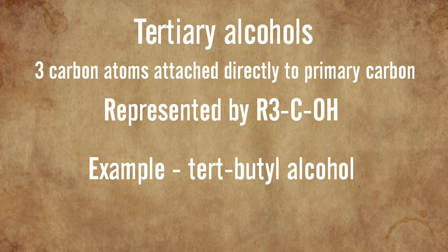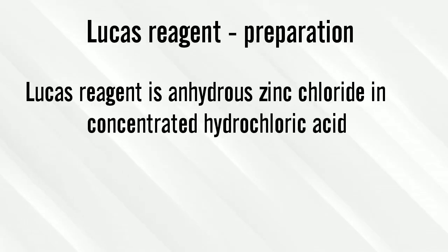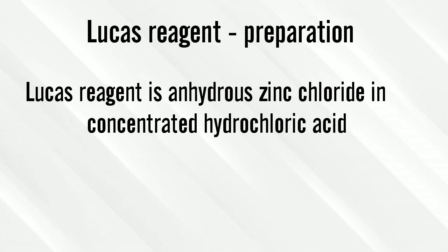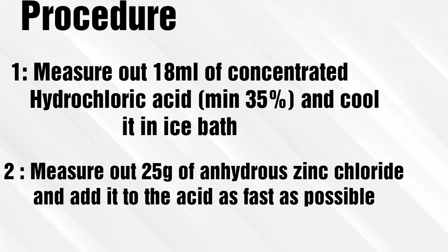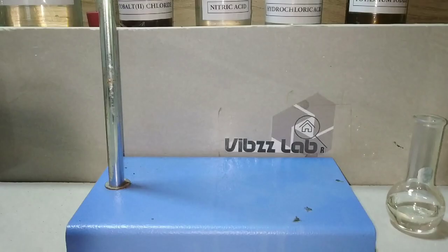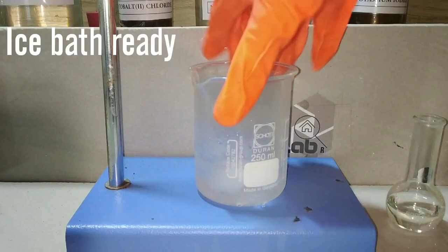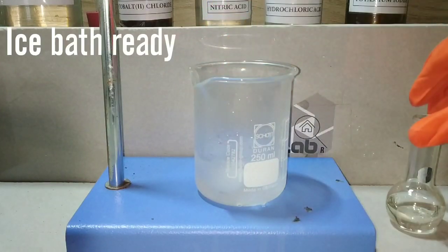The example of tertiary alcohol used is tertiary butyl alcohol. Before the test, we will prepare the Lucas reagent, which is anhydrous zinc chloride in concentrated HCl. For this test we need concentrated hydrochloric acid — a minimum of 35% — and anhydrous zinc chloride. We will also require an ice bath, as this reaction is going to generate a lot of heat.